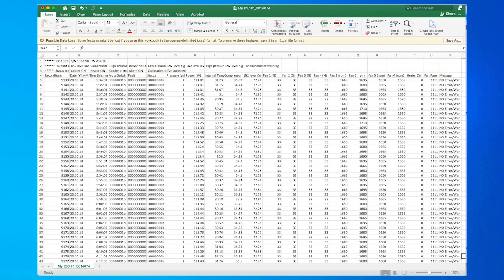All subsequent lines correspond with a certain timestamp or log number containing the respective parameter values as indicated in the fourth header line. This CSV file can easily be converted into an XLSX file using the CSV import tool of Excel, where the different comma-separated values are listed in columns. The first 3 columns show the record number, date, and time information.